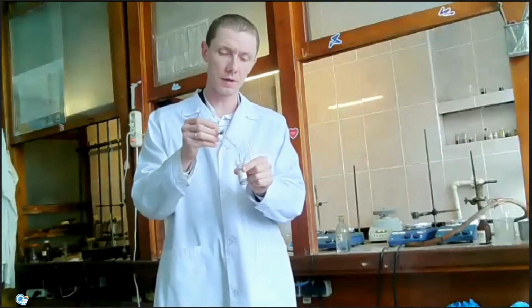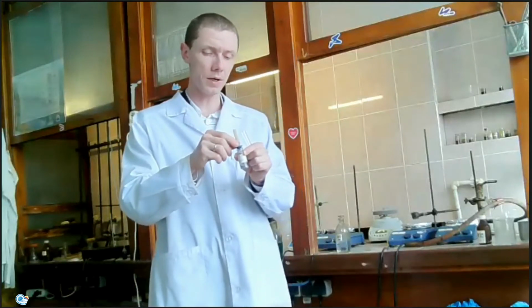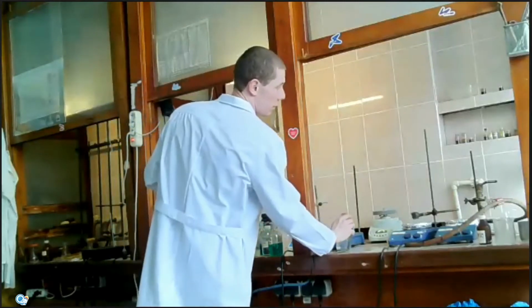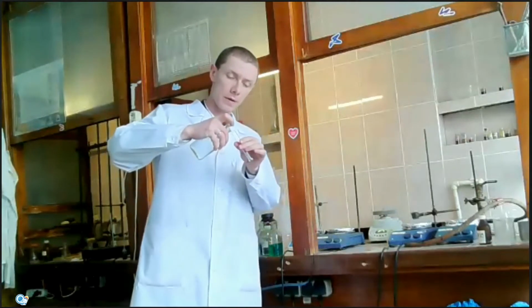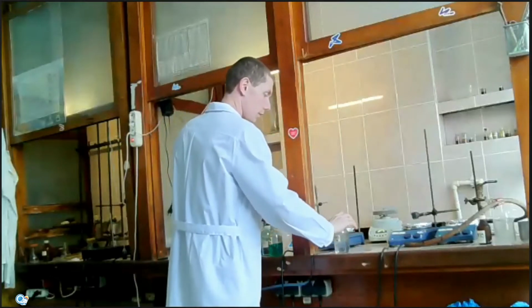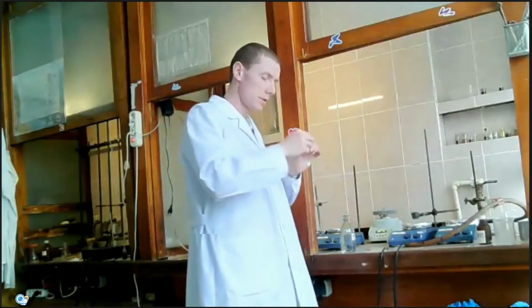Also, I think you know that silver salts, for example, silver nitrate, can react with chlorides with formation of insoluble in water silver chloride. So if I mix silver nitrate with potassium chloride, I can obtain the white color precipitate of insoluble silver chloride.